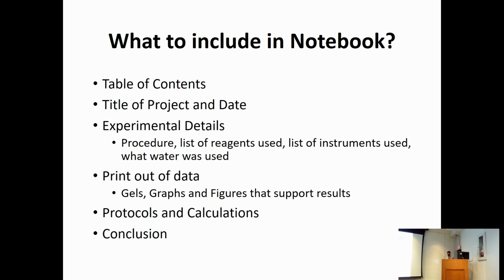Why is the list of reagents important? You are using a certain chemical for your research, and you may have it from different manufacturers. If some chemical had an impurity and you use it in your experiment, that's going to be bad, right?